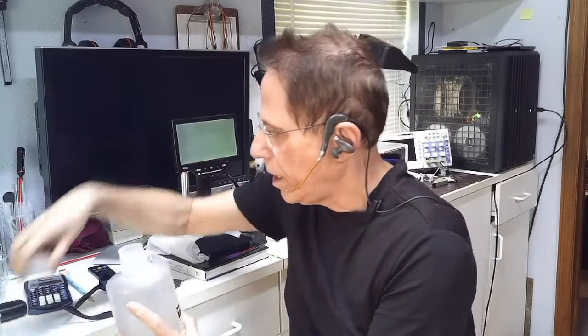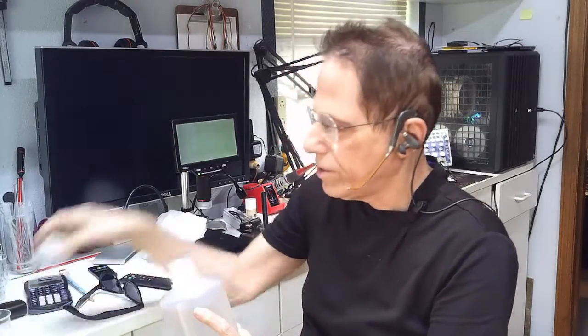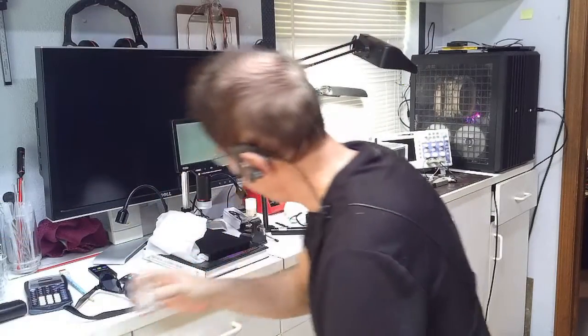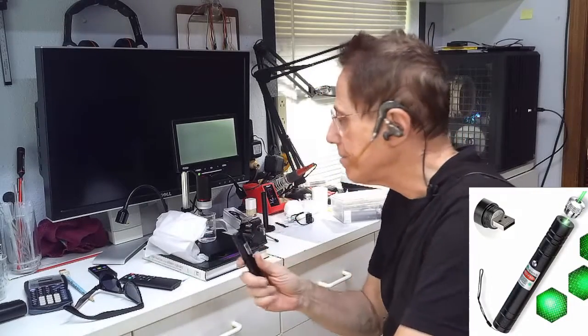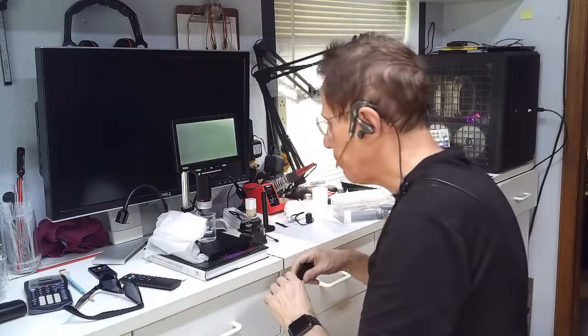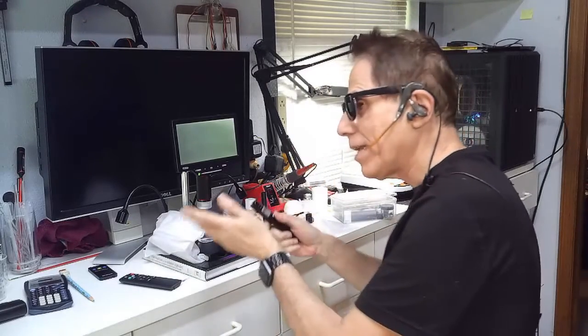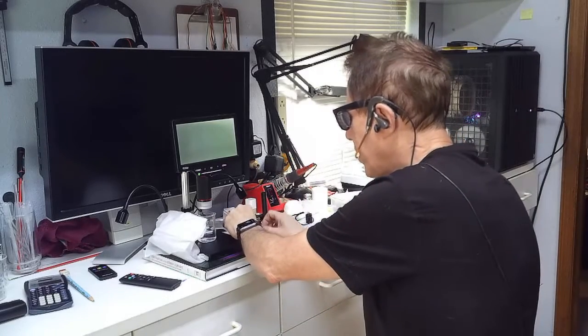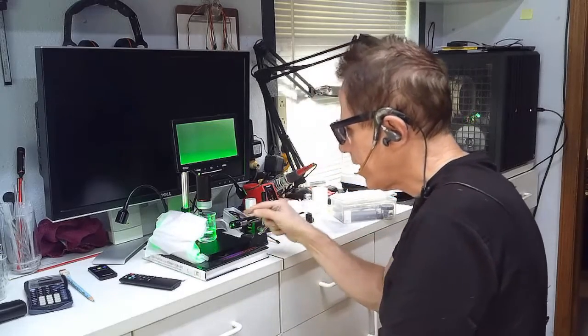I'm going to take some colloidal silver and put 30 milliliters of it in this little beaker — just enough so I can put a laser through it. I put this underneath the microscope. This is a handheld high-power laser. You want to be very careful with these or you could lose your eyes. I've constructed a little housing over here to capture the laser light so it doesn't reflect all over the room. I wear my safety glasses when I push the button. I put the laser in the vice and tighten it so the laser goes right through the liquid.